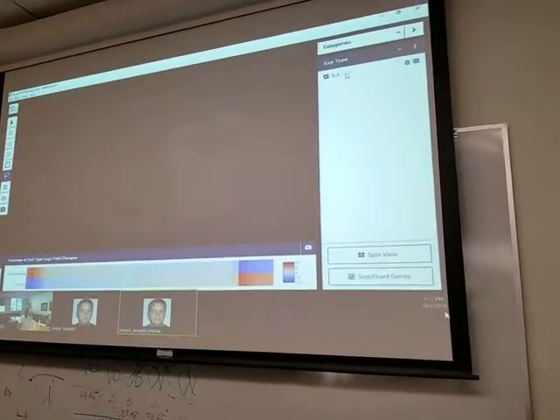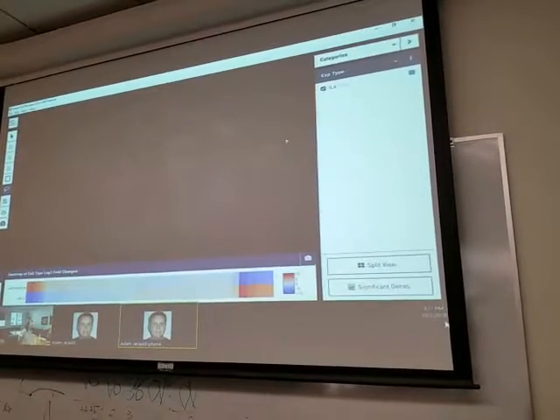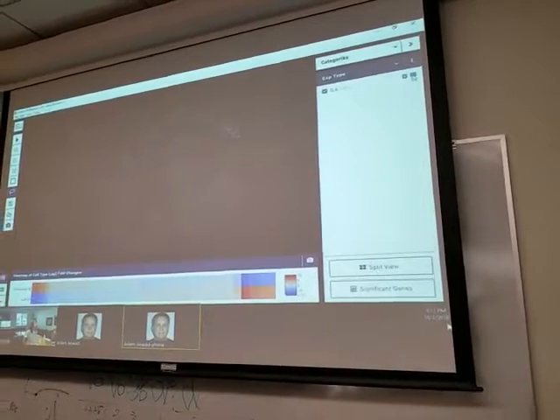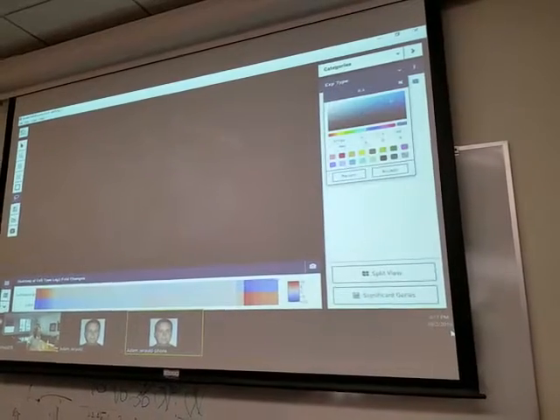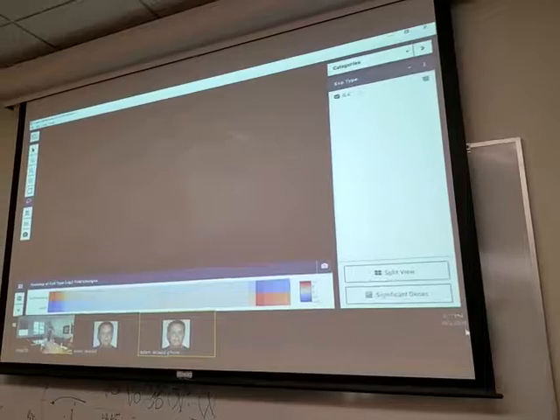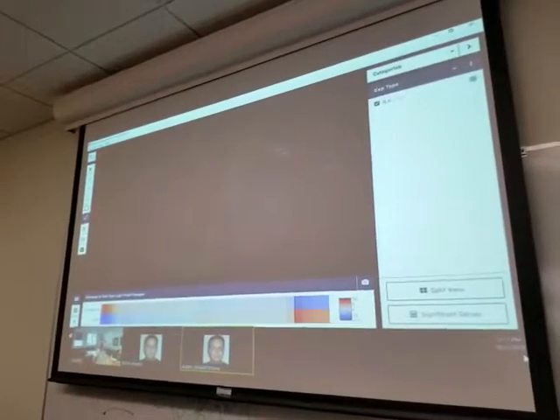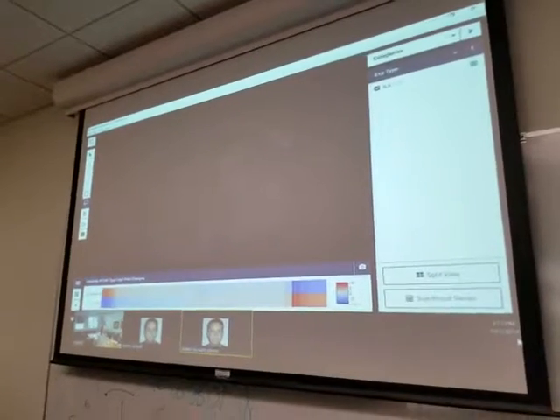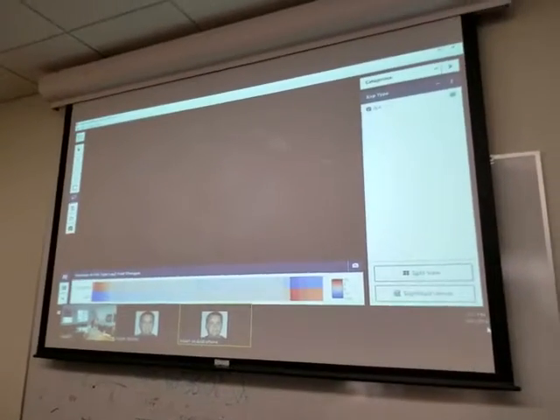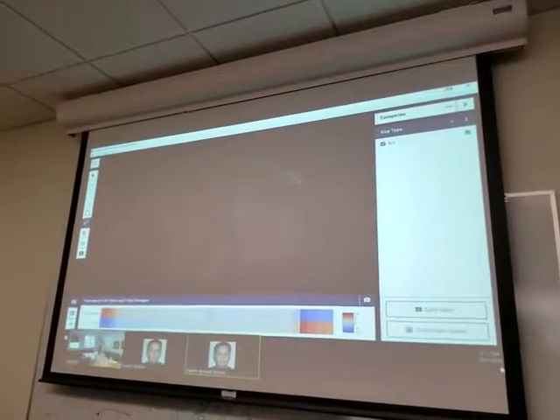Okay, so now I have 153, which I can change the color. Right now the lit up is blue, but maybe it's easier if I change it to green here. I don't know if that's any easier to see, but they're mostly in these two populations, but there are some other ones in these other clusters, these other expected cell types.